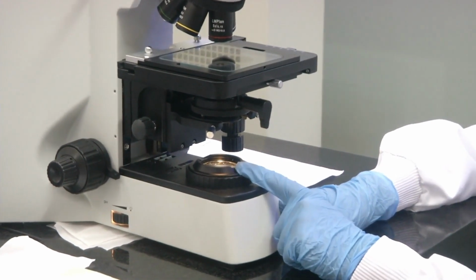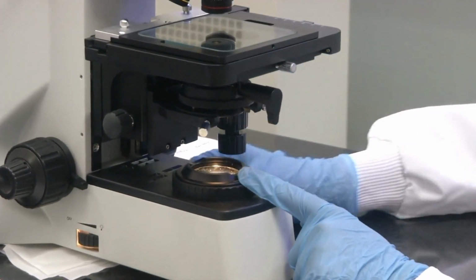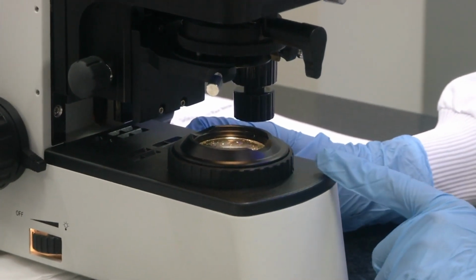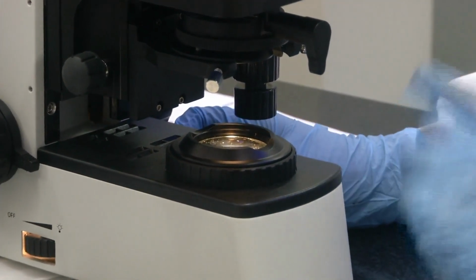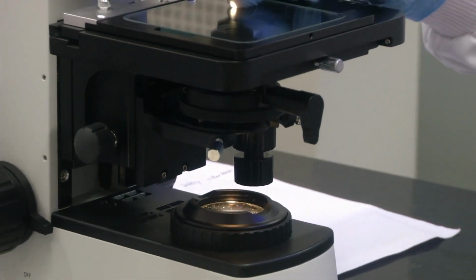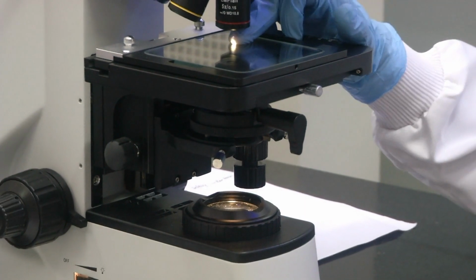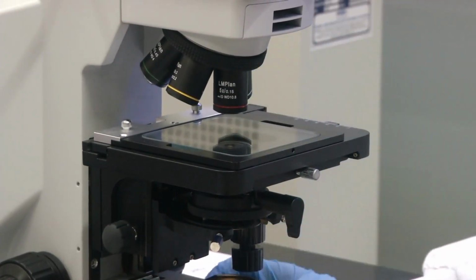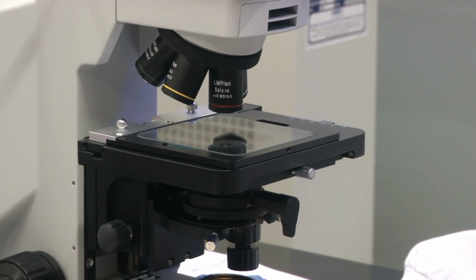This is the bottom light source. And if I switch on the top light source, I think you might not be able to see it properly, but if you look at my hand, there is light coming from the top also. So, these are the two illuminations in the metallurgical microscope.